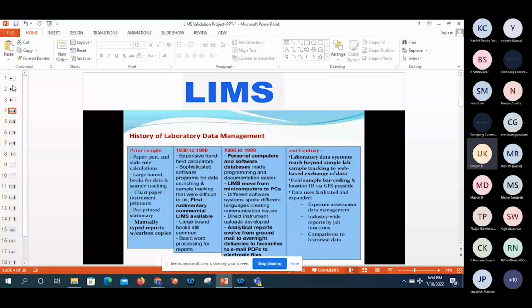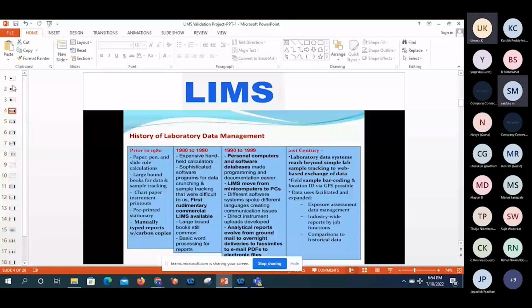Hello. Yes, sir. You are explaining things related to operation procedures. Nowadays we are using LIMS, analyzing those things and masters also. So in CSV, what are you going to perform, what are you going to tell us? You said these are related to masters and analysis, like procedures. You are telling about lot management work.